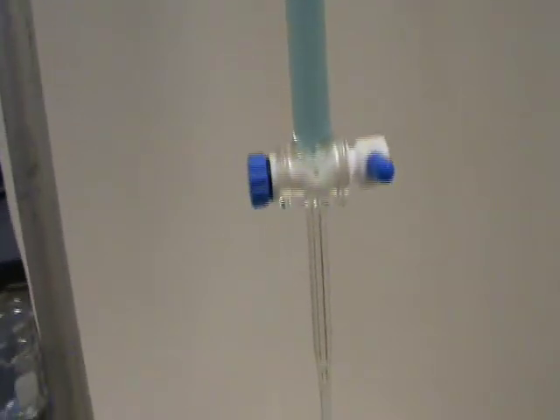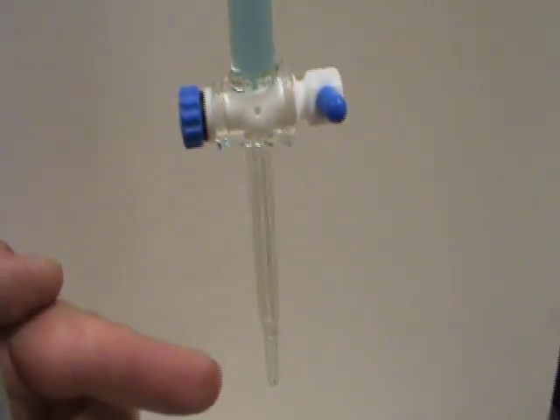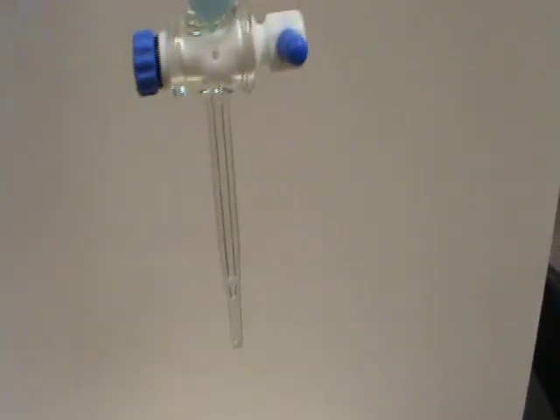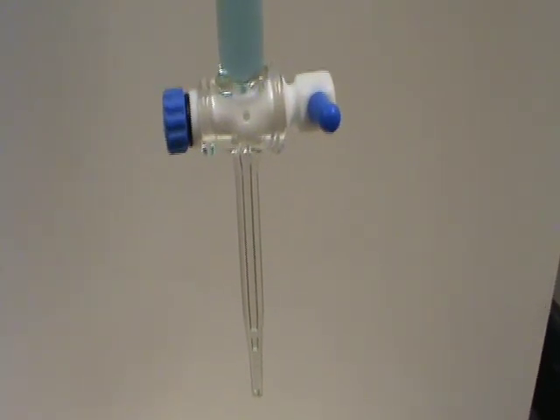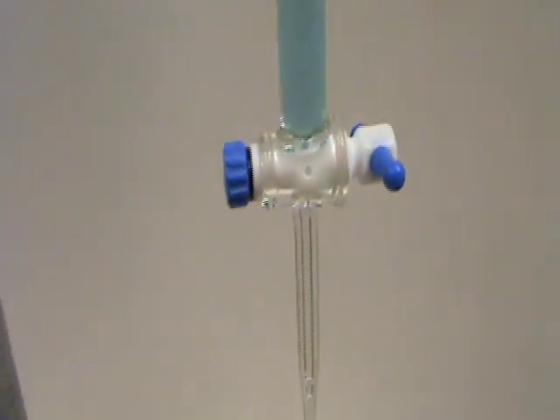There's our stopcock and you'll notice that the jet tip isn't full right now, but you can probably see that there's a little bit of liquid stuck in the tip. If we were to start our experiment this way, all of the air that's in this tip would be error in our experiment.